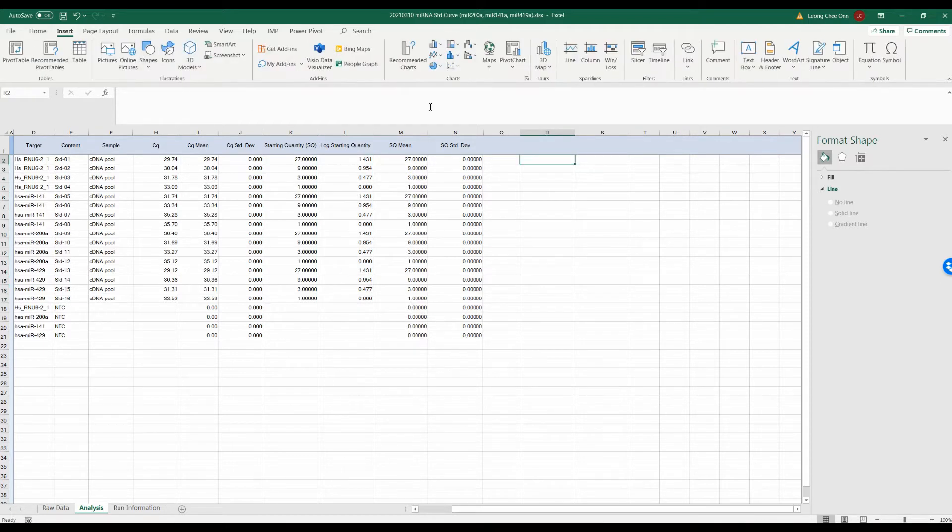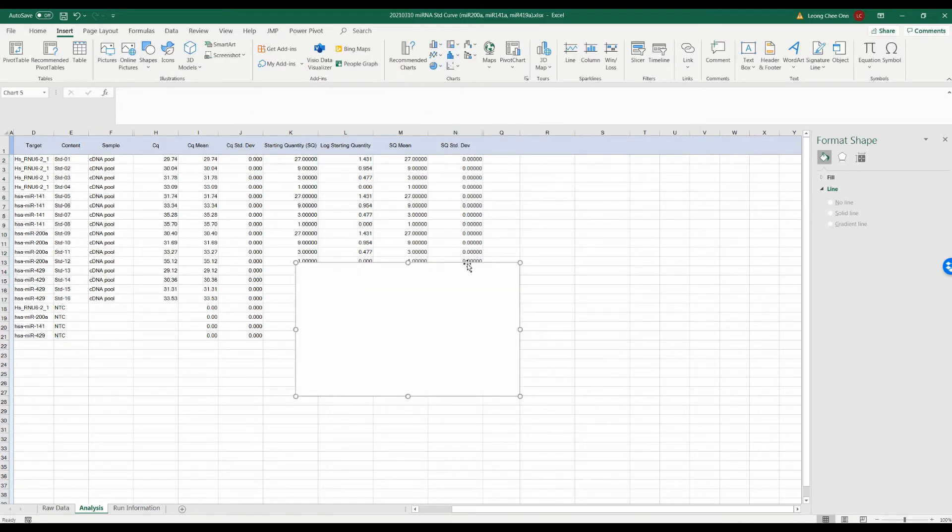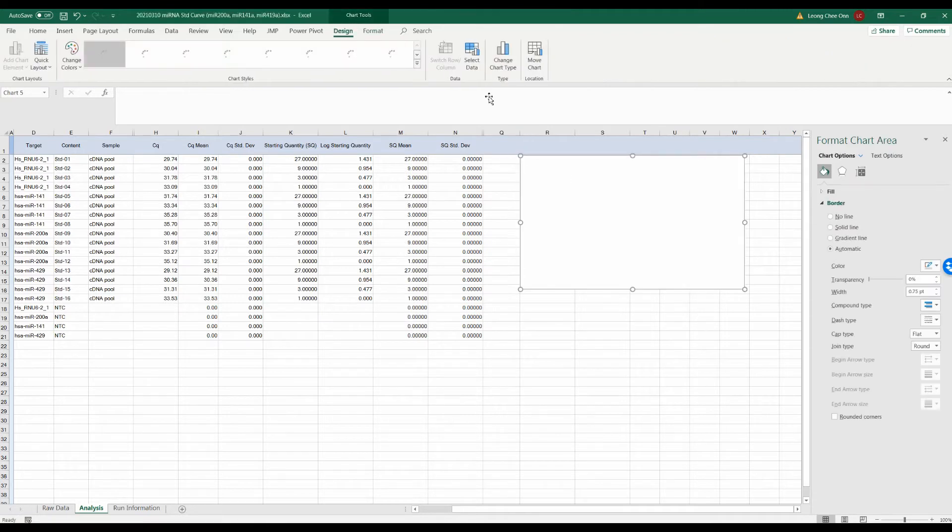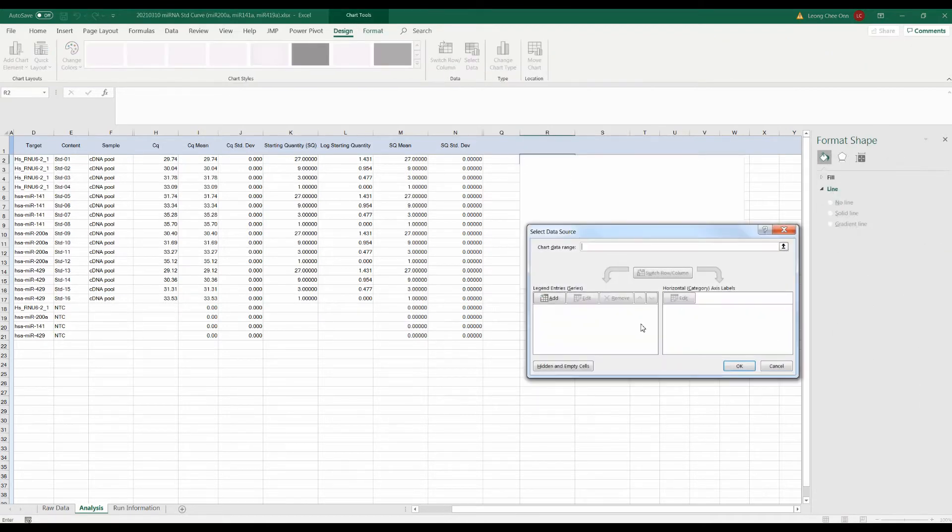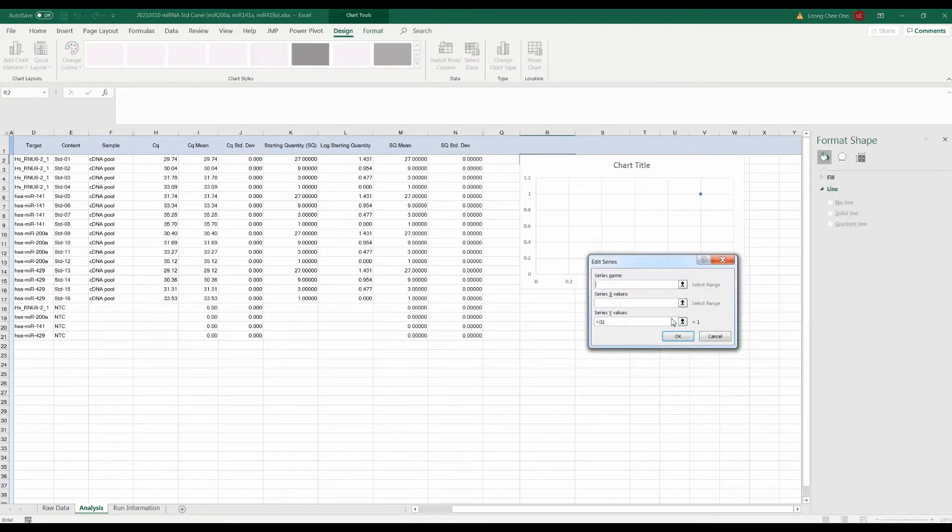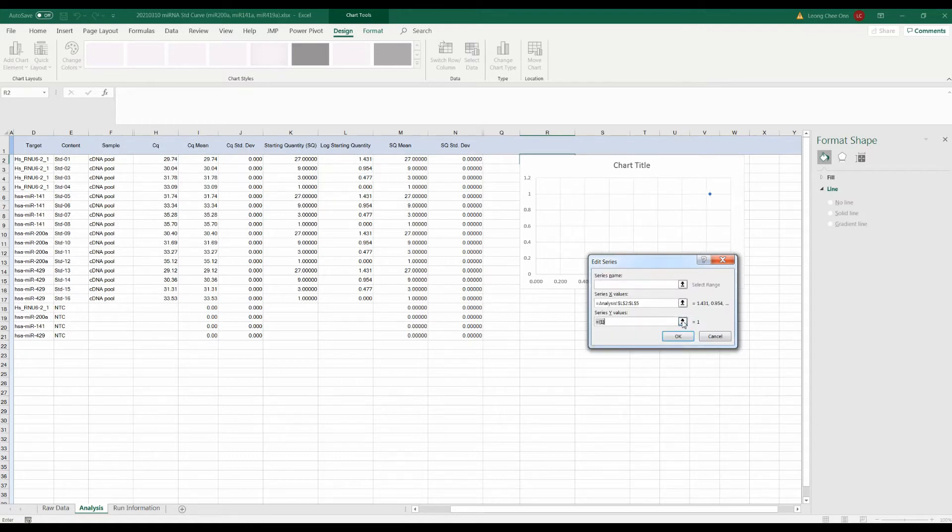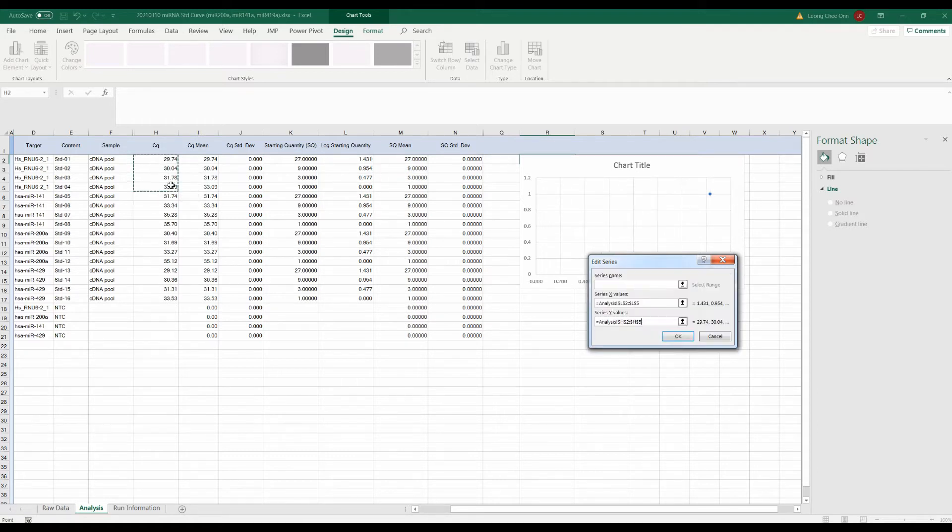Note that the log SQ is also automatically calculated here. To generate the standard curve, we plot the CQ versus log SQ value. We will include a trend line, equation and R-square here.